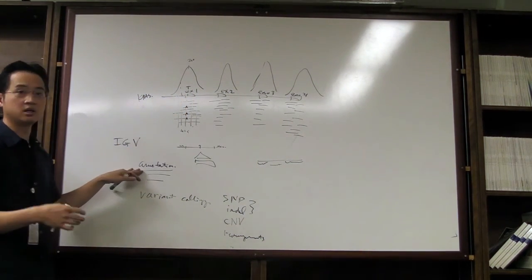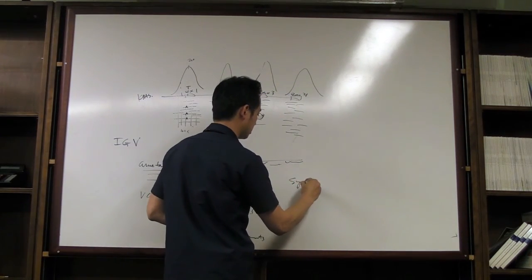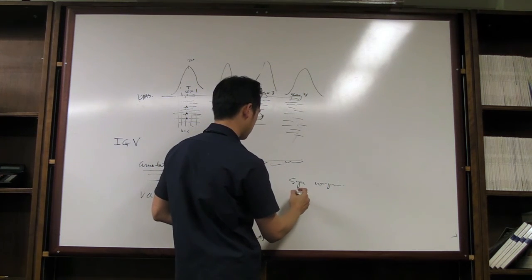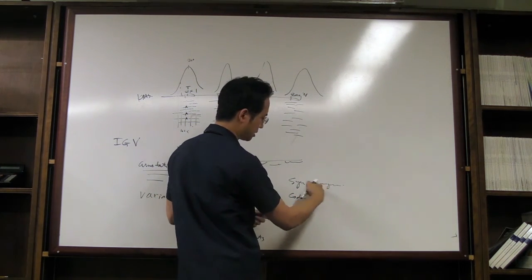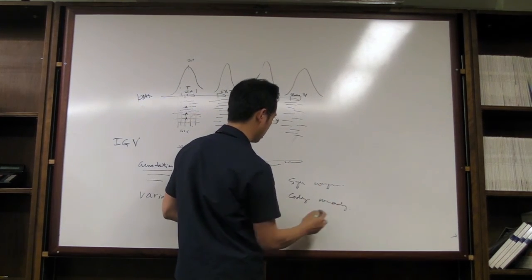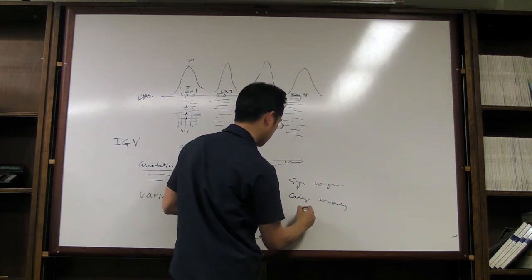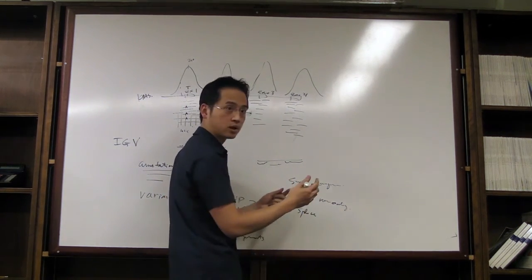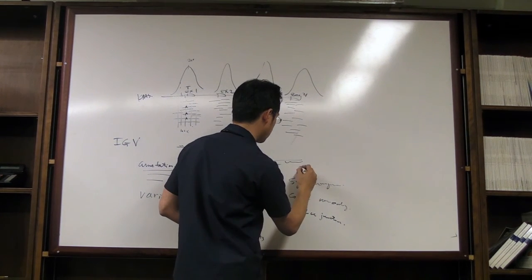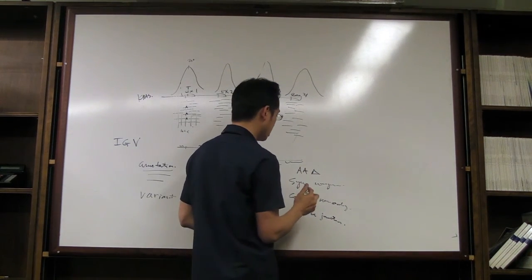Thereafter, you want to annotate even more. So you want to annotate, is it synonymous or non-synonymous? Is it coding or non-coding? I mean, I guess it's intuitive here, right, that it is coding. You do a coding region or non-coding. Synonymous or non-synonymous. Is it a splice junction mutation? Let's say it's in a splice site. You can do these types of annotation. What is the amino acid change that you're getting? That's another level that you can do.